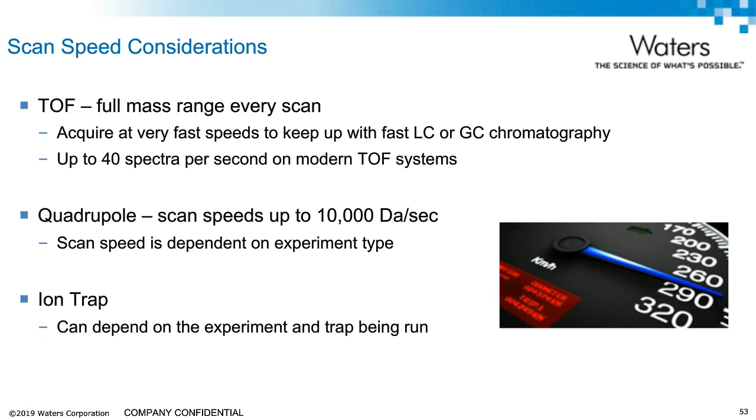Acquiring faster or a wider mass range can lower the time spent on each individual mass, meaning lower quality data could be acquired. Total cycle times for ion trap systems are comprised of multifunctional stages and can vary significantly based on desired mass analysis times and selected mass ranges.